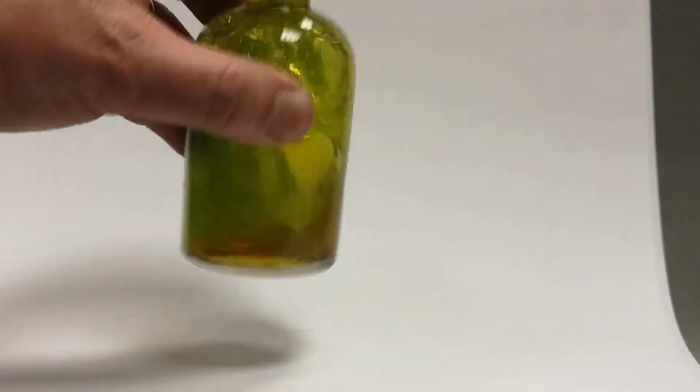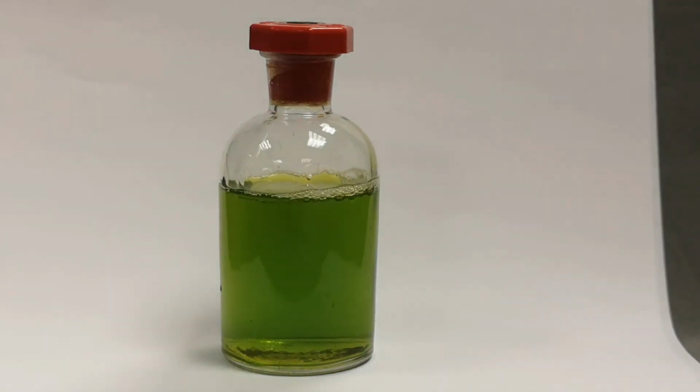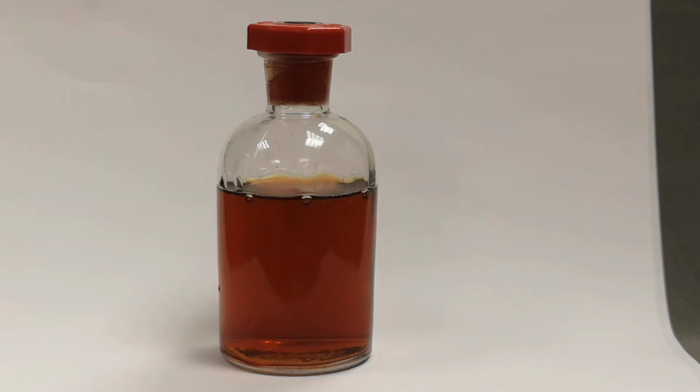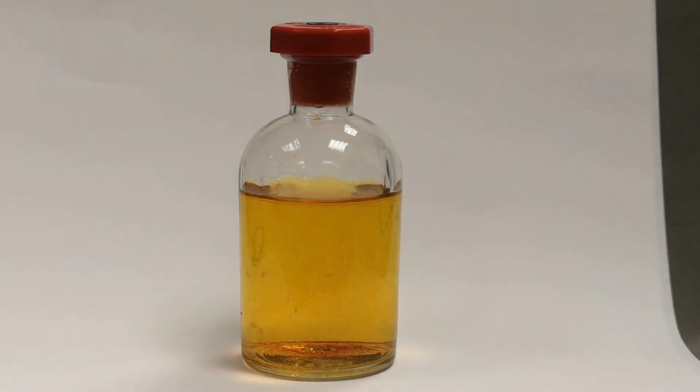In this case, the dye has an intermediate partially reduced state as well. Once reduced, the solution is yellow. If you give it a gentle swirl, it oxidizes slightly and goes red, and then if you shake it properly, it oxidizes fully and goes green. On standing, it goes back through red to yellow, like a set of traffic lights, albeit one working out of sequence.